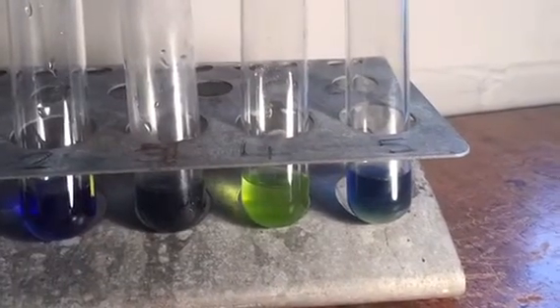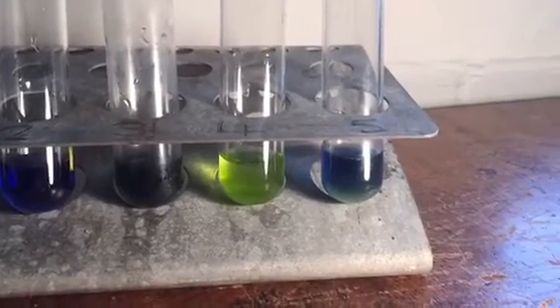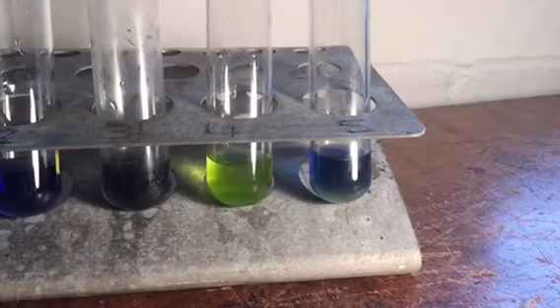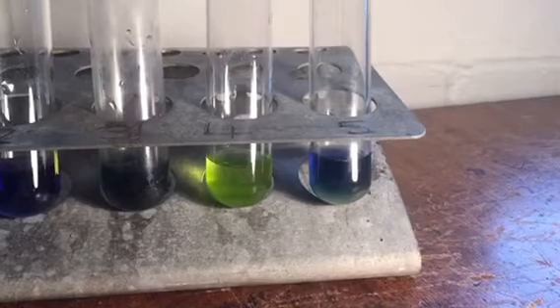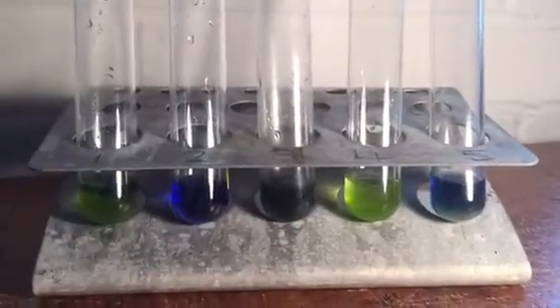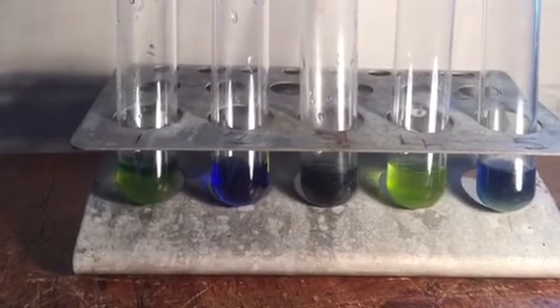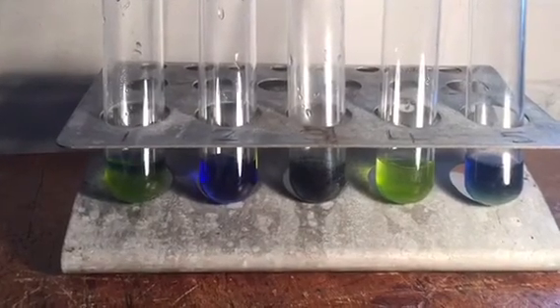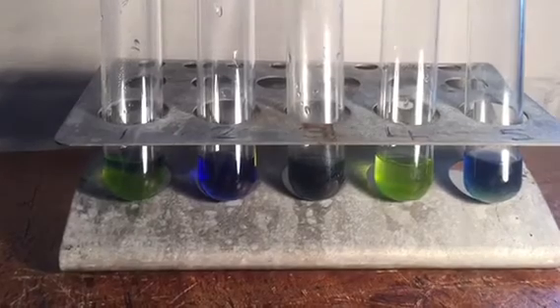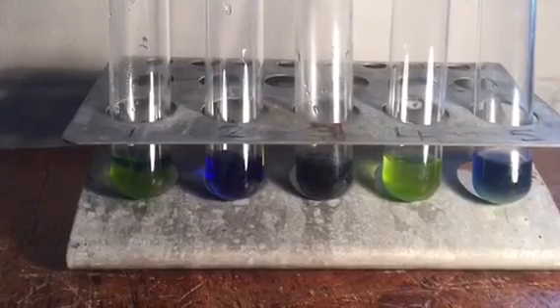Tube five, our supernatant, stayed mostly blue. There might be a couple of chloroplasts that got into the supernatant, but mostly blue because there are no electrons produced in the cytoplasm of the cell - so none in the supernatant, so the DCPIP isn't reduced and remains blue. Overall our experiment shows that for photosynthesis to occur we need chloroplasts, which are present in tubes one and three, and we need light, which is present in tube one, and that shows that electrons are produced during the light dependent reactions of photosynthesis.